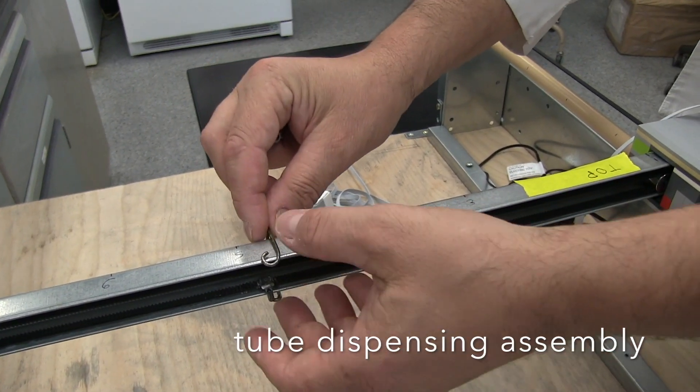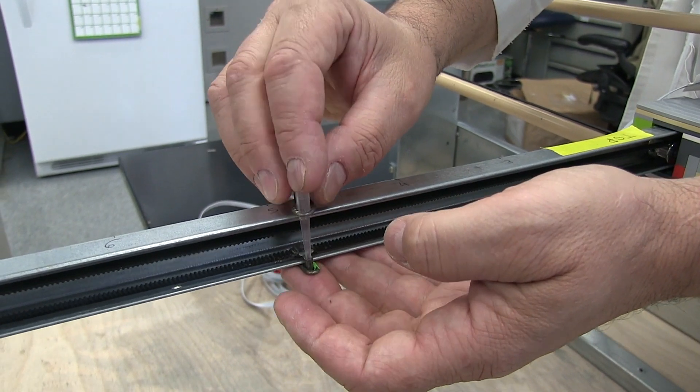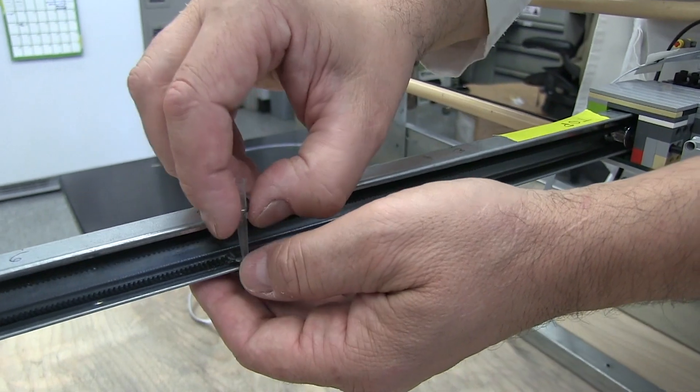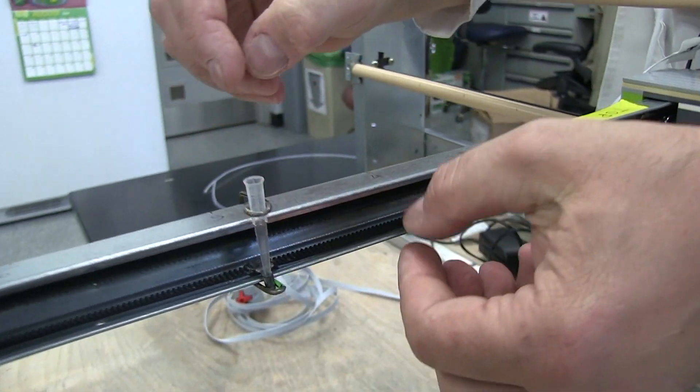In this step, the HPLC tube dispensing assembly is attached with a simple 200 microliter pipette tip used to thread the HPLC tubing through.